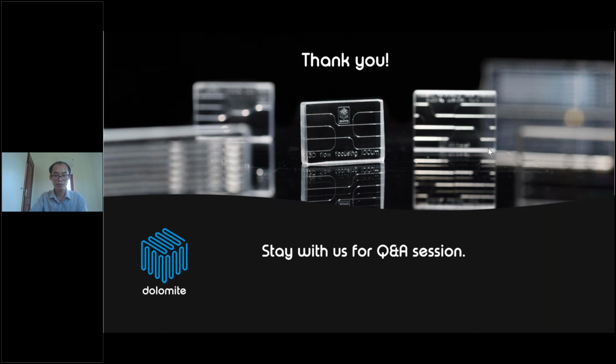Okay, one more question from Pretty. Can we avoid using organic solvent? How would it affect the size of the particles? What do you mean by organic solvent? We use ethanol as the alcohol in our process for generation of lipid nanoparticles. After processing, we can easily remove the ethanol and water to generate the dry liposome.